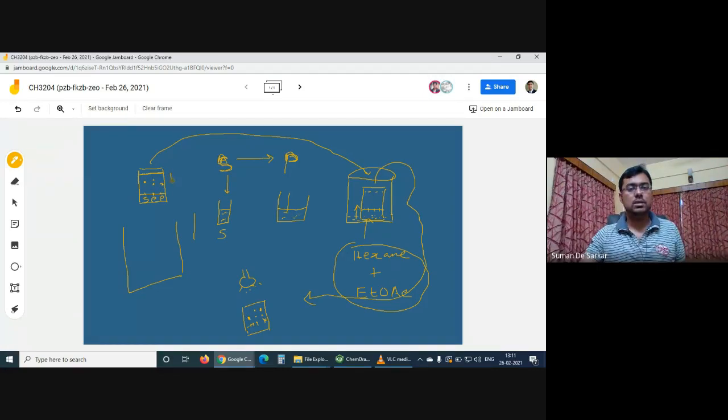This distance we will measure with a scale, and we will take this as one unit, one. So from this pencil mark to this pencil mark, we'll take as one, and compared to this, whatever distance is there, we'll calculate. Suppose in this case, if this distance is 1, it will come roughly 0.8. And this distance for the product, suppose roughly it will come 0.5.